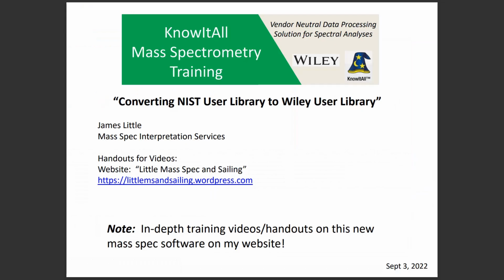In conclusion, I hope you found this video on converting NIST user libraries to Wiley user libraries useful. This and other resources for using the KnowItAll mass spec software are available on my personal website.